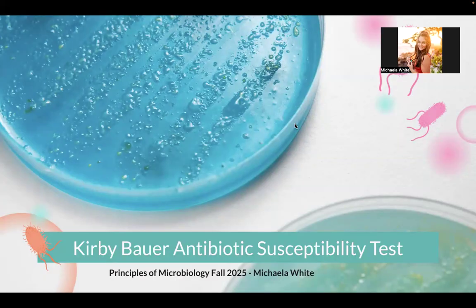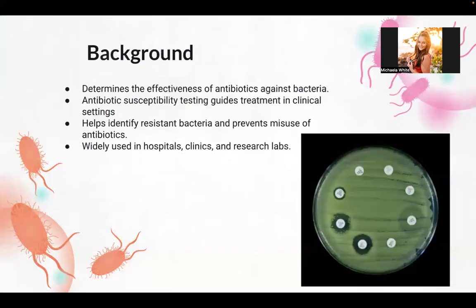Hi, everybody. My name is Michaela White, and today I will be presenting my lab investigation on the Kirby-Bauer antibiotic susceptibility test that we did. Basically, this test helps determine how effective antibiotics are against specific bacteria and has many applications in healthcare and microbiology research.